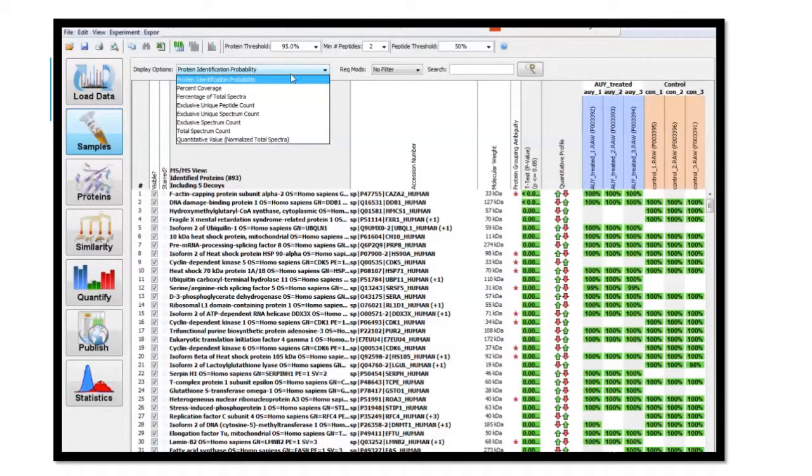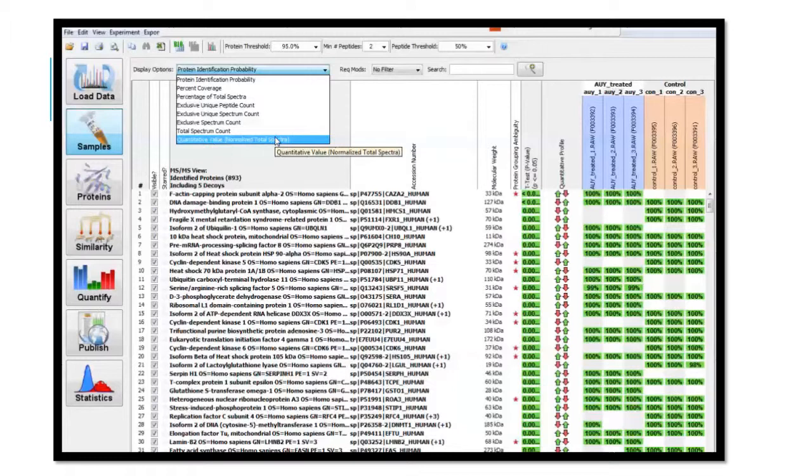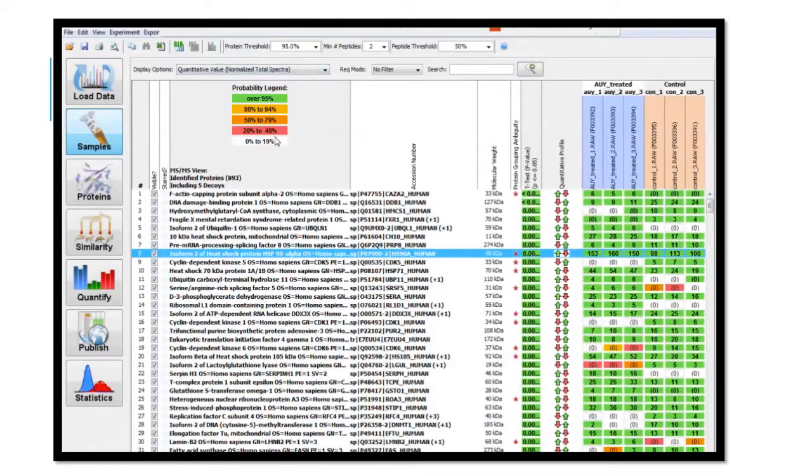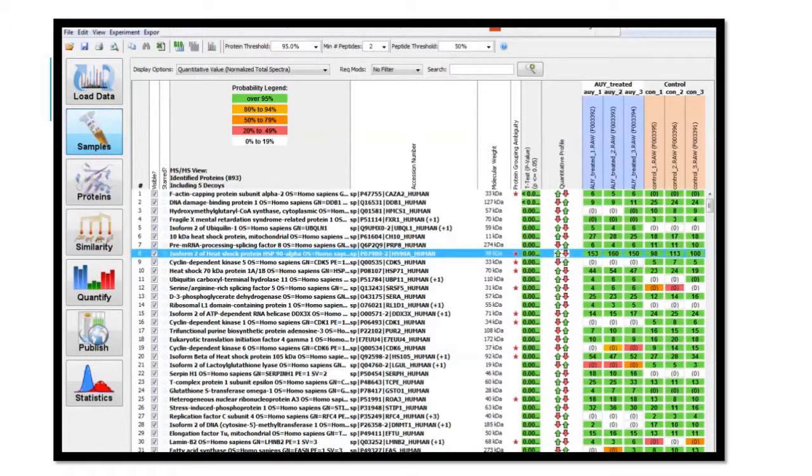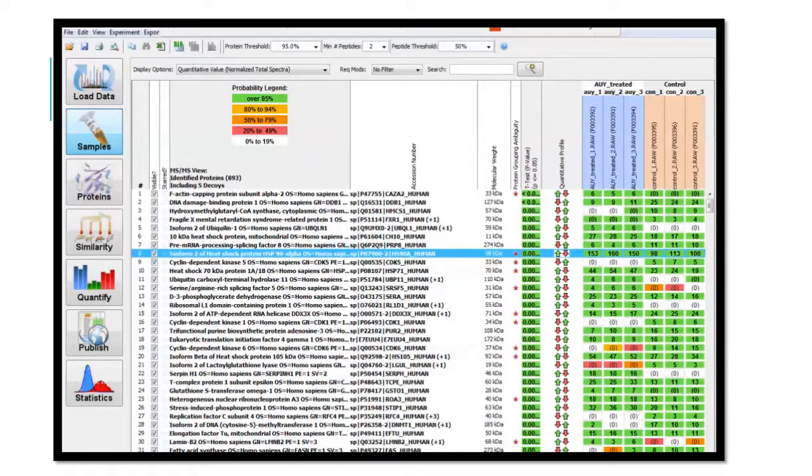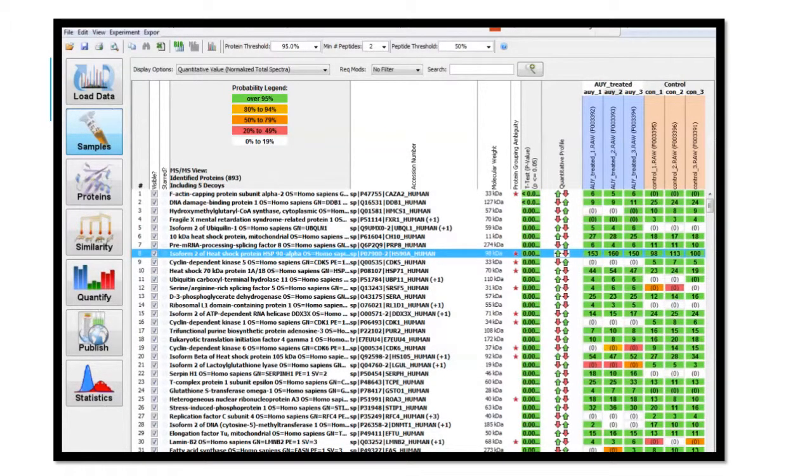Choose Quantitative Value Normalized Total Spectra. Scroll to the far right of this screen. You should now be able to see measured values for each protein in all cell cultures.